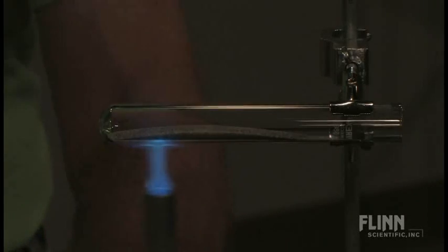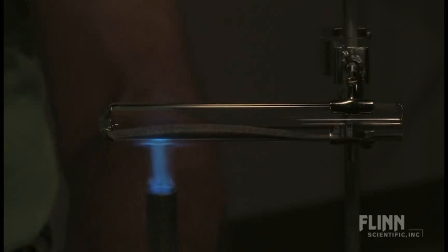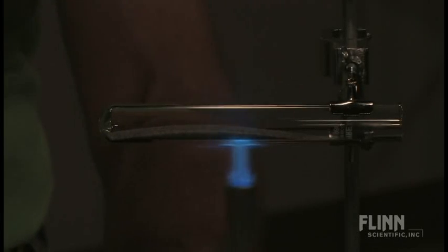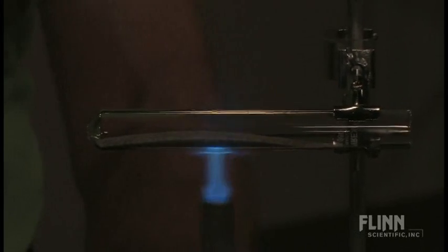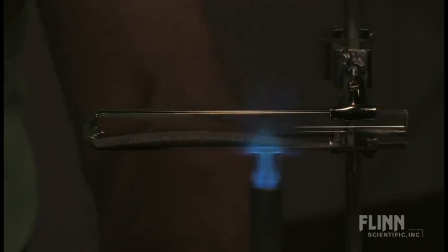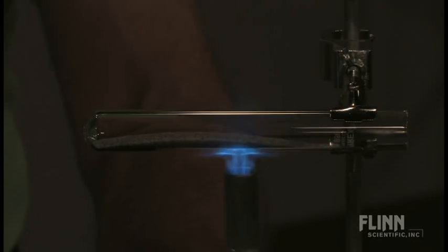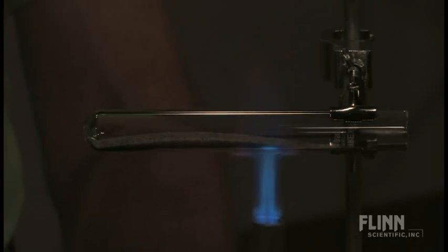The first time I did this and watched what was happening, I was so excited. I ran around and grabbed every chemistry teacher at the school I was at, said, "You gotta come and see this." I think I did the reaction like 7 times. You gotta see this, this is so neat. I would have never thought sand and magnesium would react with each other. Now we're getting there. We may or may not get a little pop here. It doesn't always pop.